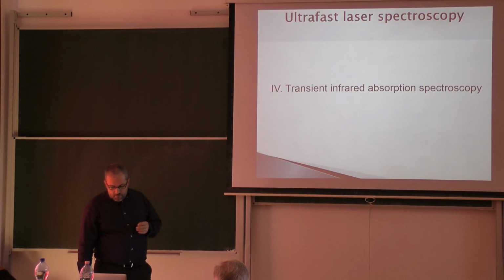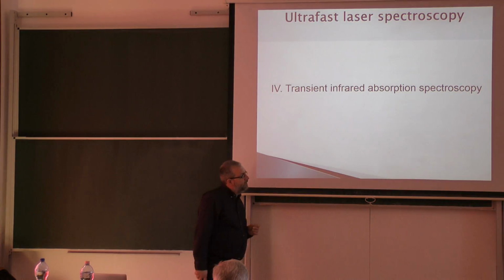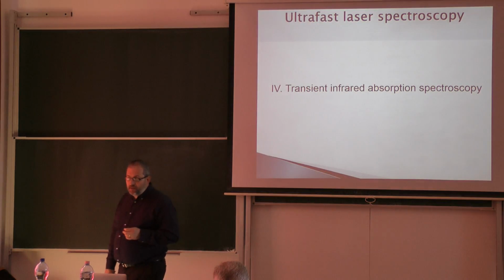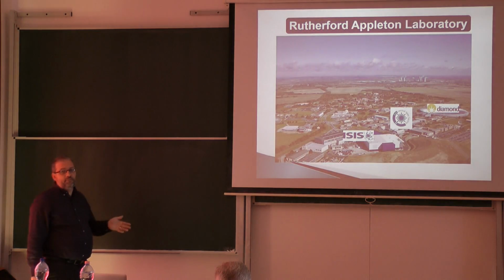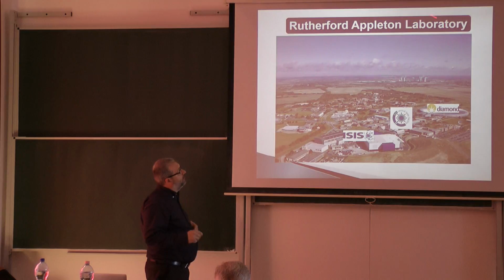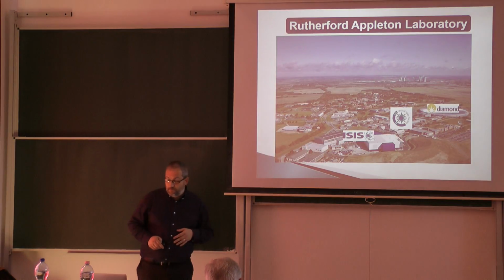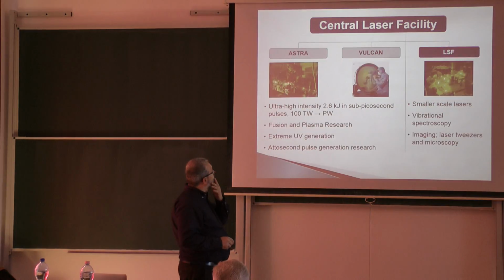One of our colleagues did it in London in his lab. He got a lot of money for this, but not many labs have that amount of money. So it happens at research complexes, and the research complex I'm visiting is called Rutherford Appleton Laboratory, and this is the CLF, the central facility where we have the apparatus we are using for transient infrared absorption.